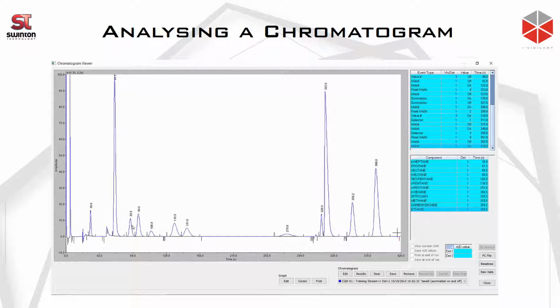If we go further from there, we basically then detect the CO2 peak, and then we detect the C2 peak or the ethane peak, and then it gets to the end of the cycle, so we put an inhibit on at the end of the cycle. And that's basically how we look at this chromatogram as per what we have learned before. And we can basically zoom it in depending on what we want to see in the chromatogram.